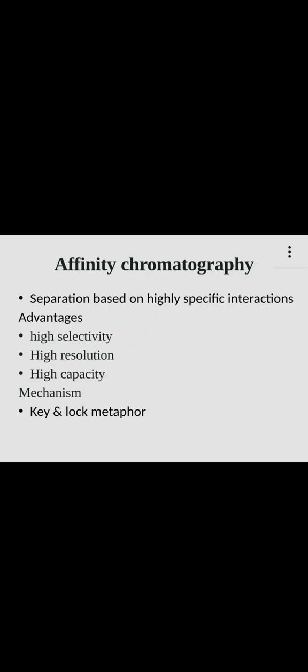So only molecules that can interact with the stationary phase will be retained, which may be just one type of molecule in a mixture. And then it has very high capacity. So a large amount of analyte can be purified in a single run.